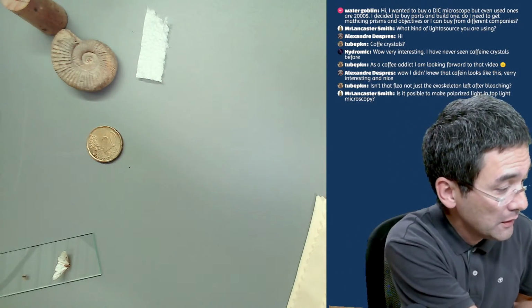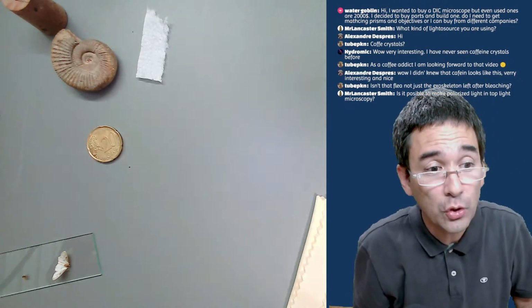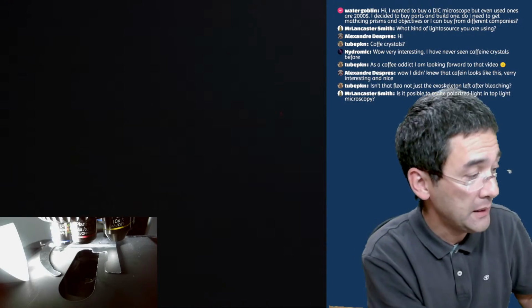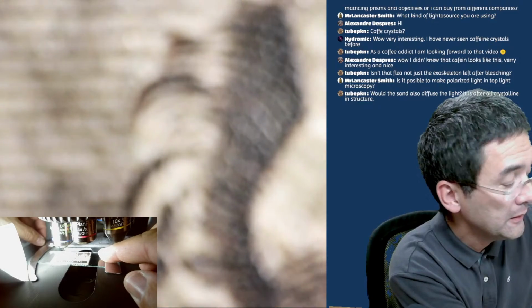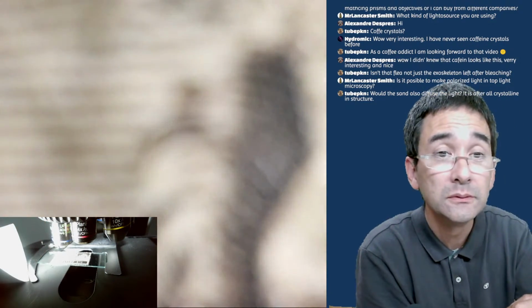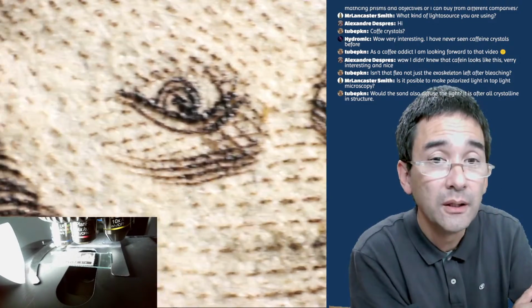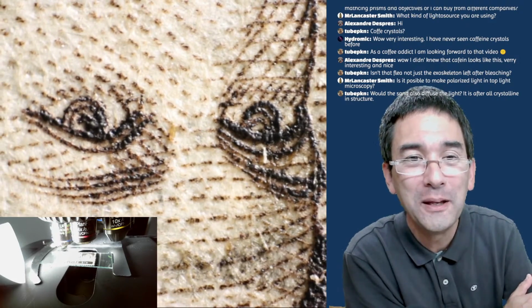When you put the stamp under the microscope, you know what I'm going to do? This is not a good way of doing this. Just a second, I need to switch over again. I'm going to put it on a blank slide, because then I can move it around much more easily. The stamp is now right side up, and then you can actually see the print, and here the eyes of the queen on the stamp, upside down.